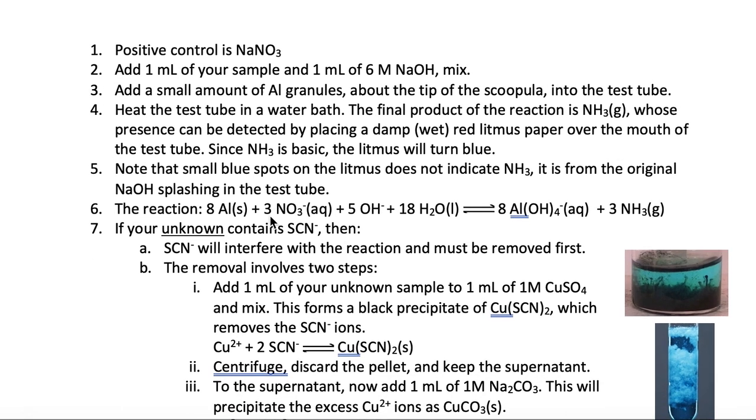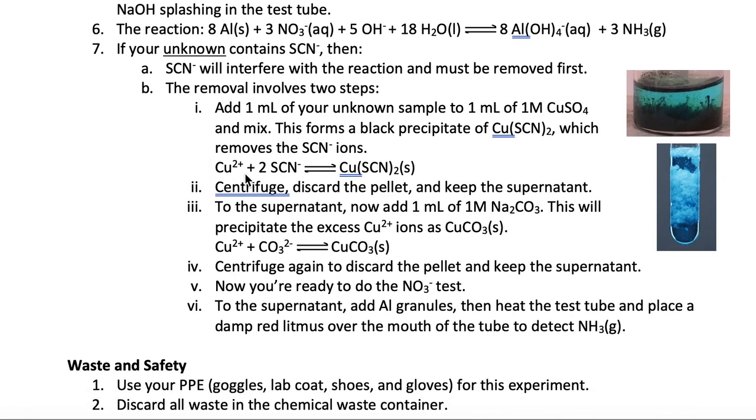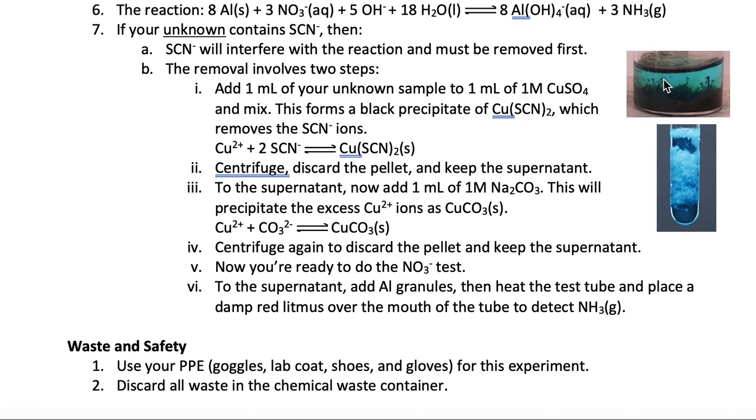If your unknown has thiocyanate in it, this test won't work. So you're going to have to remove the thiocyanate first. The removal occurs in two steps. First, you're going to add copper sulfate to precipitate the thiocyanate as copper thiocyanate, which has a black color precipitate as shown here. You then centrifuge to remove the pellet that contains the copper thiocyanate.